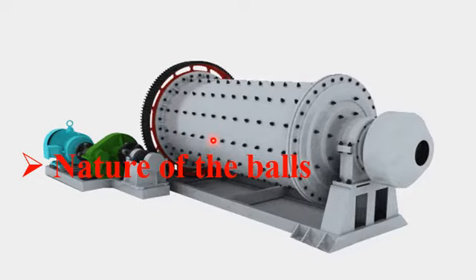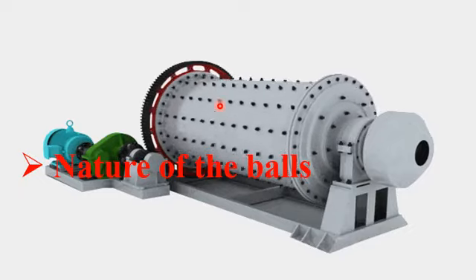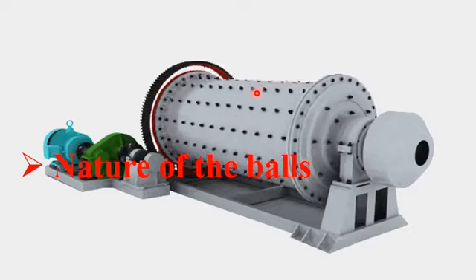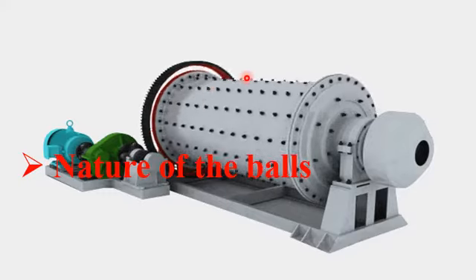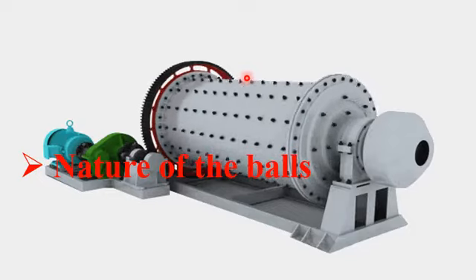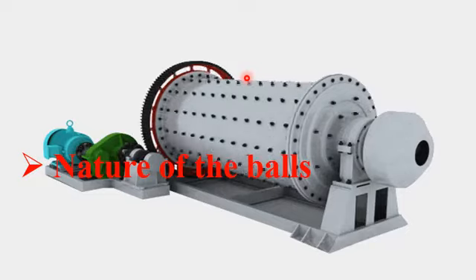So the ball used in ball mill operations will depend on the initial precursor material which we want to crush. If you want to crush a harder material, usually tungsten balls are used.